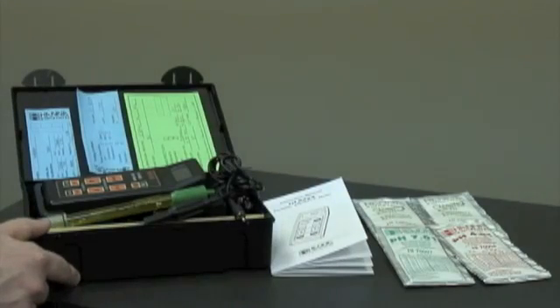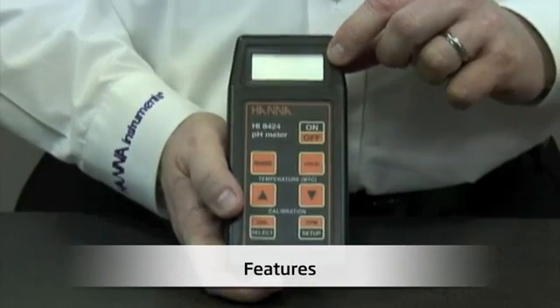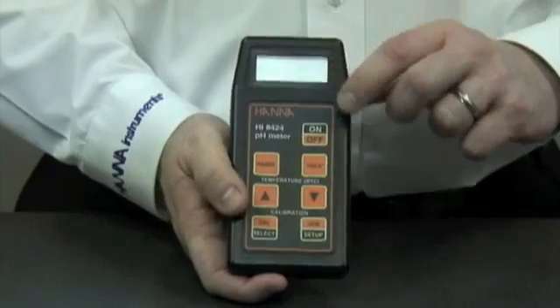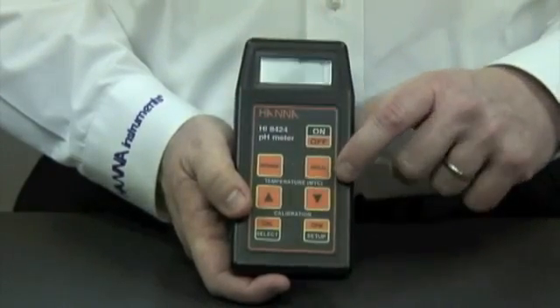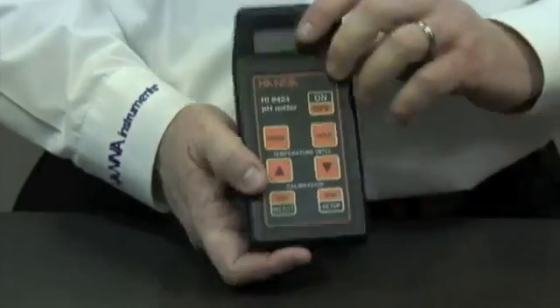Now I'd like to show you some features of the unit. Here we have the LCD display which shows pH, millivolt, and temperature in either Celsius or Fahrenheit, the on-off button, the range button, the hold button that will hold the readings, temperature buttons for manual temperature compensation, calibration button, and setup button.